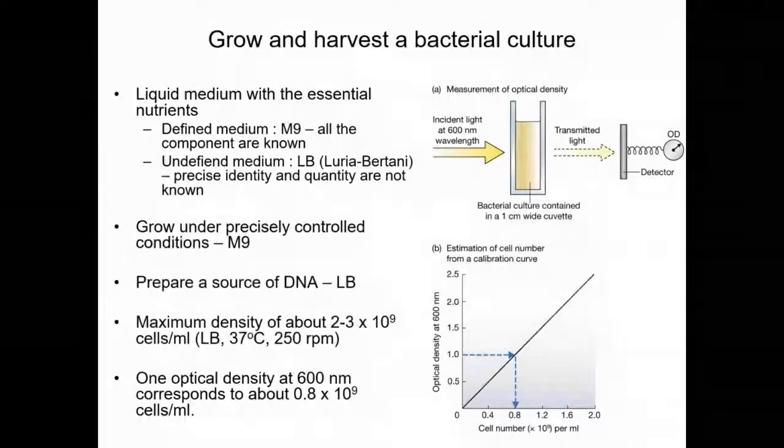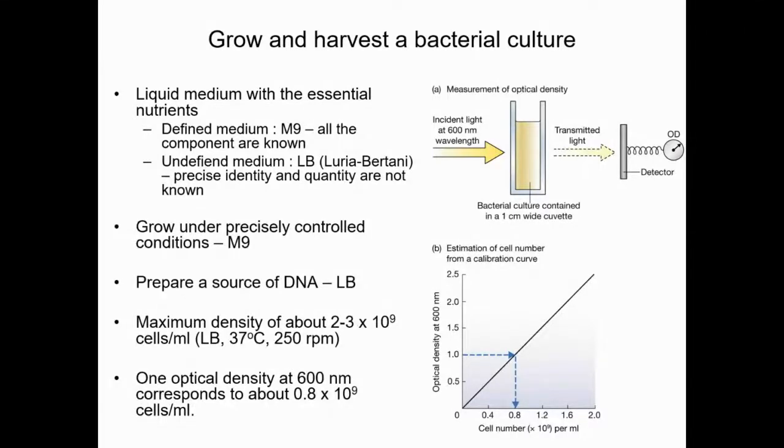This is very important, it will be in the quiz and in the exam. You have to know how to calculate the amount of cells if the OD reading is given. Any question?